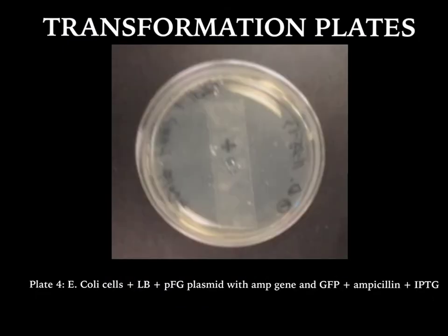We expected cell growth as well for this plate, but again did not achieve any cell growth. However, there should have been cell growth of those cells that took up the plasmid. The surviving cells should have fluoresced due to the presence of the IPTG molecule, which attracts a special RNA polymerase to the promoter that will express the GFP gene and result in cells that will fluoresce a green color under UV light.